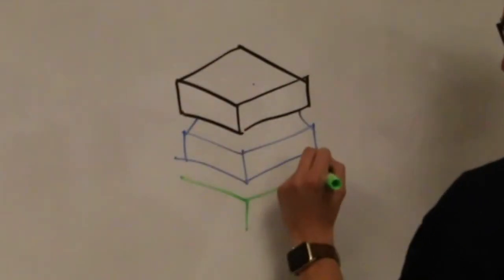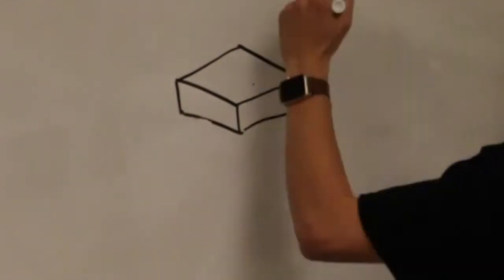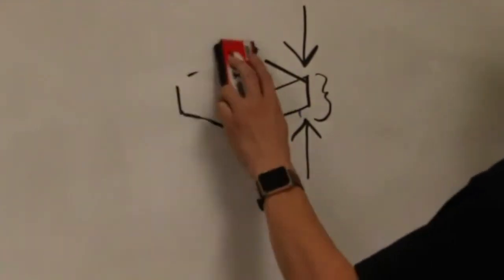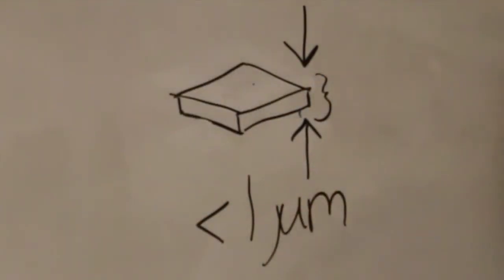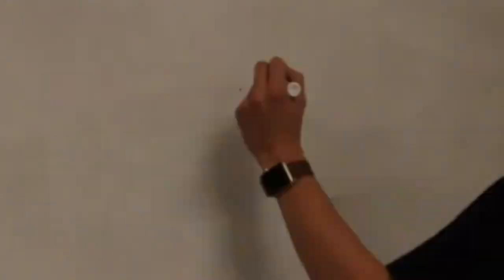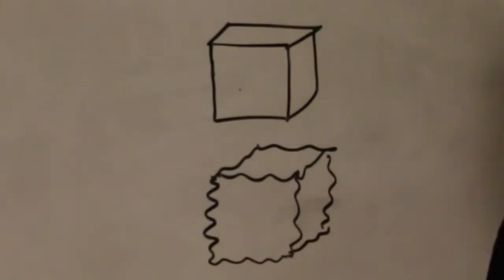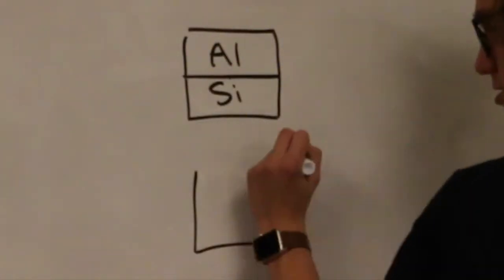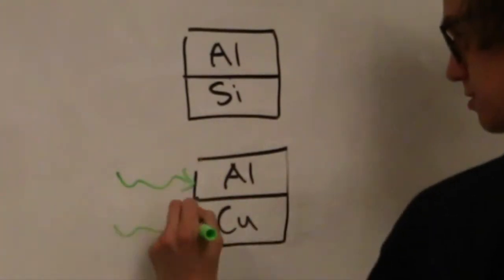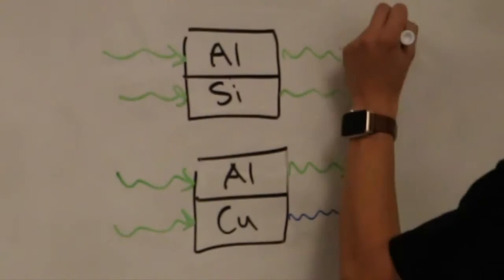Resolution of a 3D generated model depends on the quality of the voxels, or 3D pixels, which in turn depend on how thin we can make them. Due to this, micron to submicron resolution is difficult. The edges of the sample also have poor resolution because there isn't a lot of material there to deflect the incoming X-rays. Also, features inside of the sample with similar chemical compositions, for example aluminum and silicon, will not be noticeable in the model since their compositions deflect X-rays similarly.